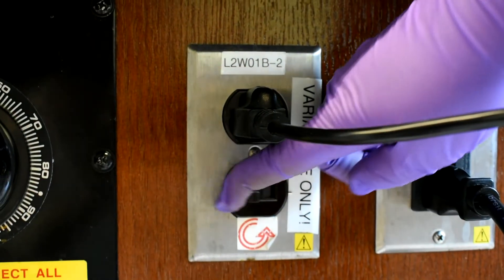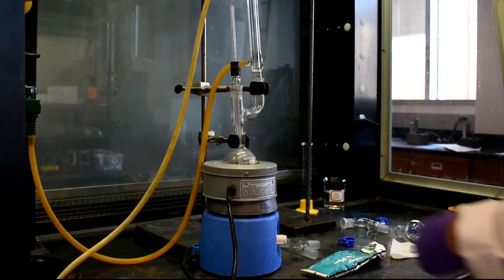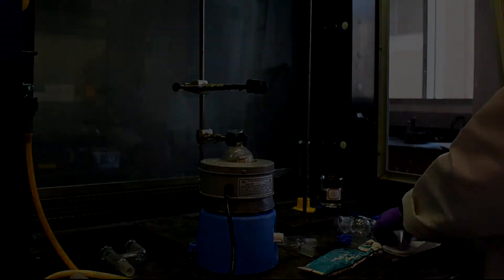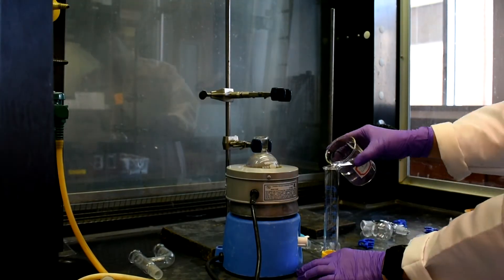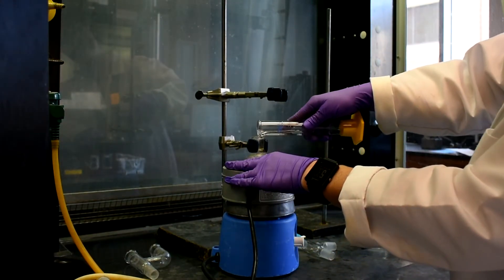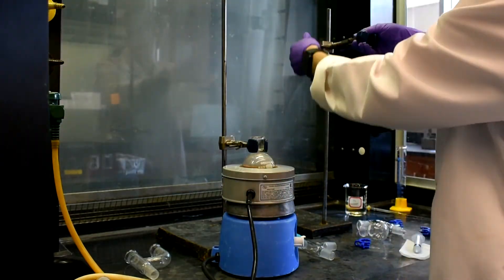After 30 minutes, turn off the Variac. Turn off the water. Then disassemble the reflux apparatus. A distillation will be performed to remove the 2-bromobutane from the reaction mixture. Using a graduated cylinder, measure 20 milliliters of DI water. Then set up for a simple distillation.